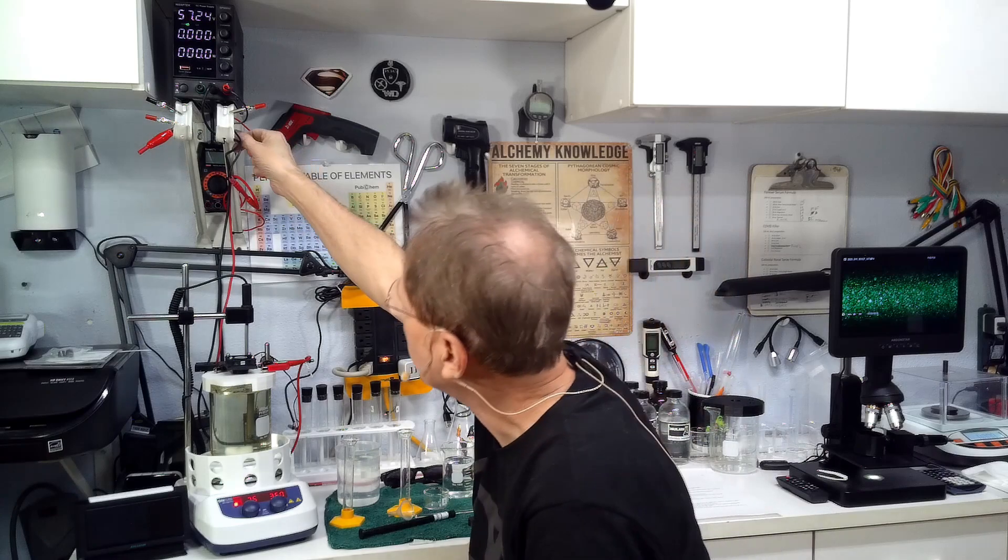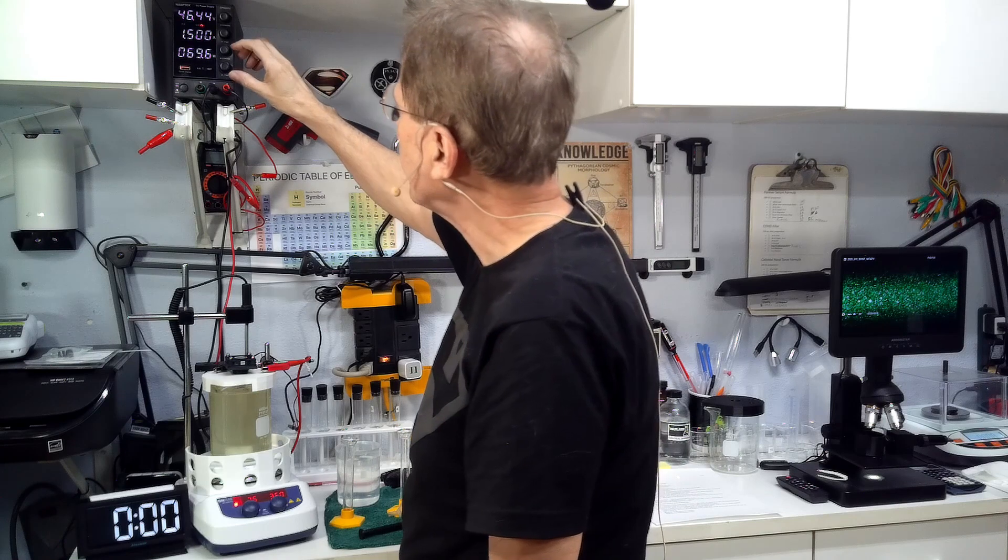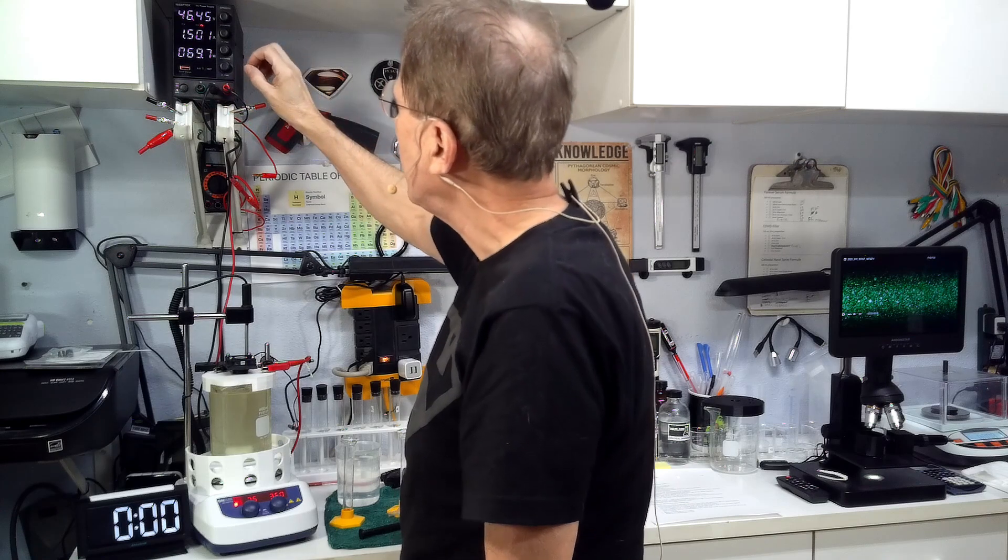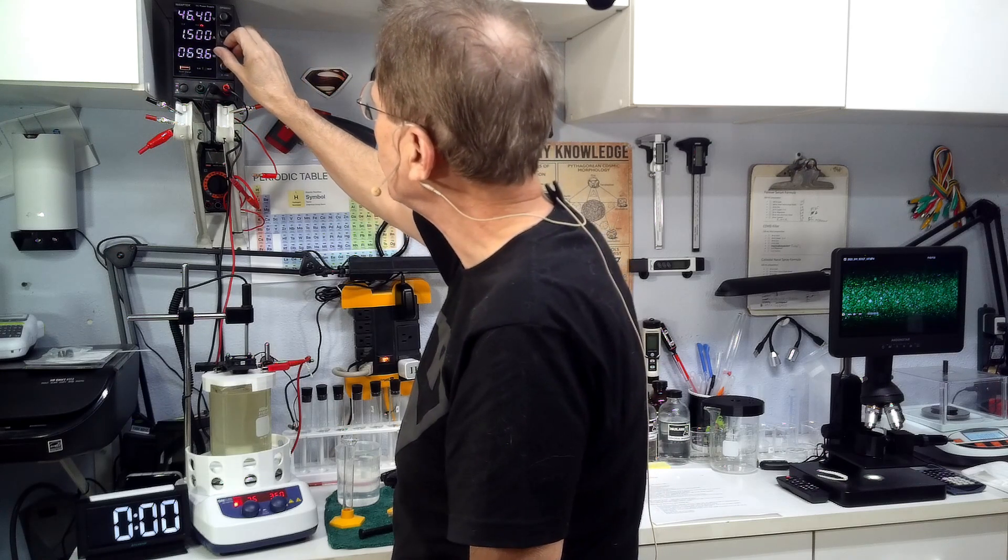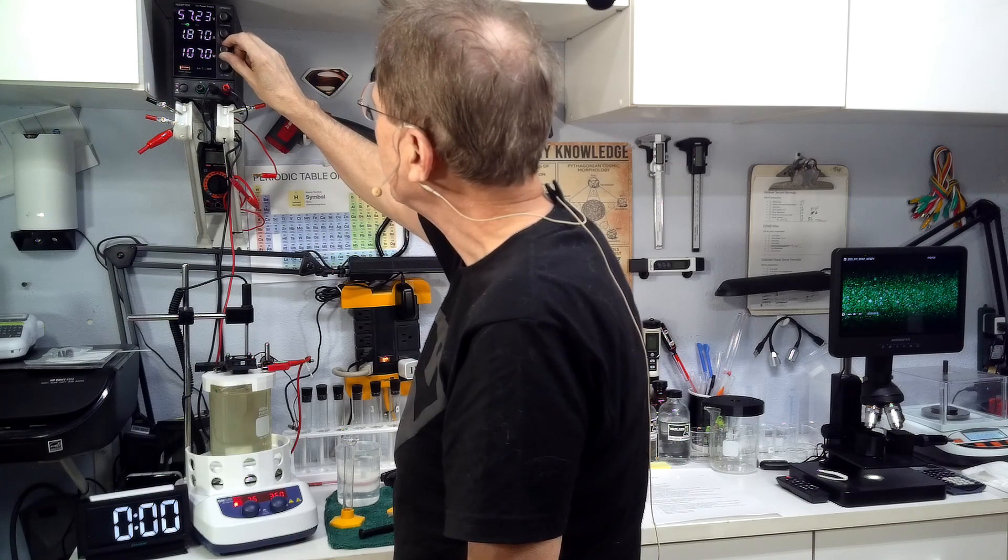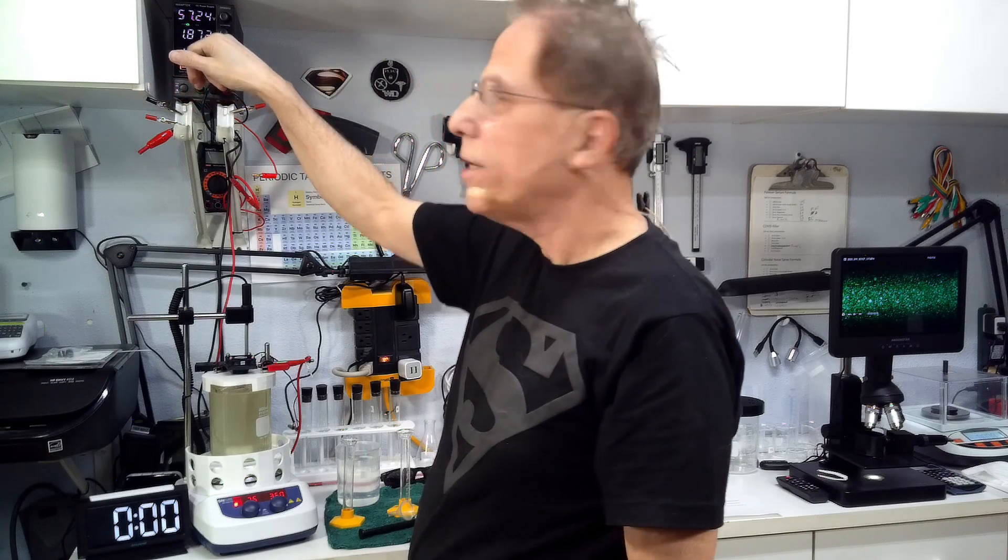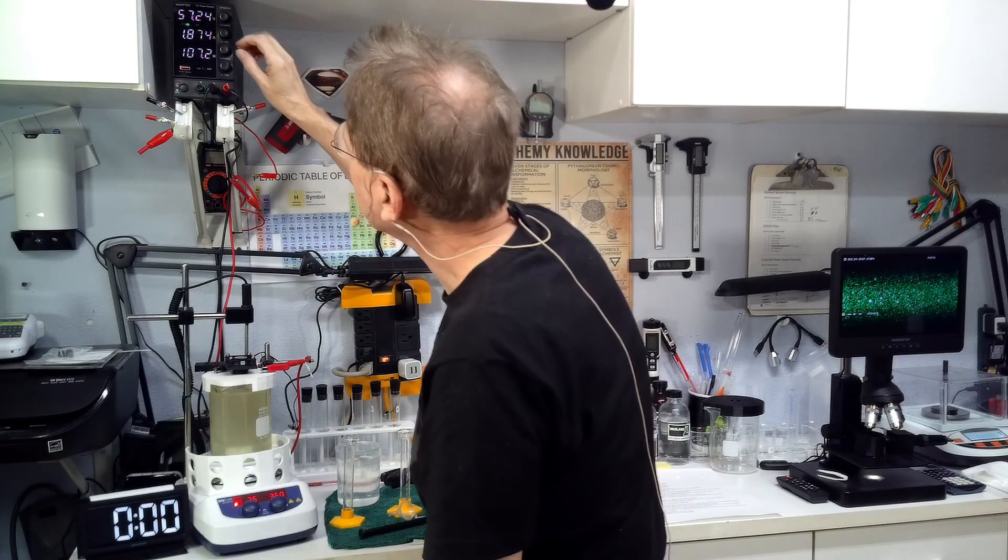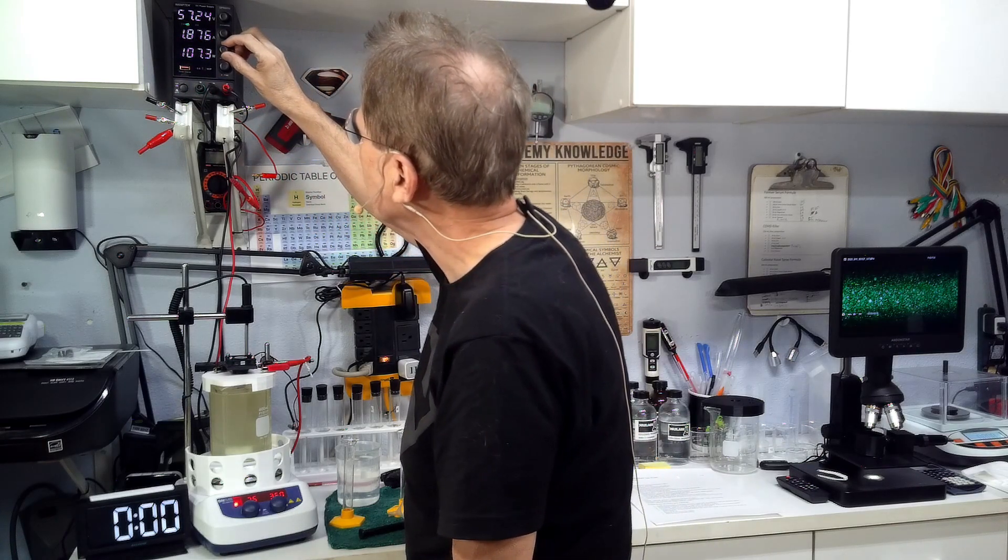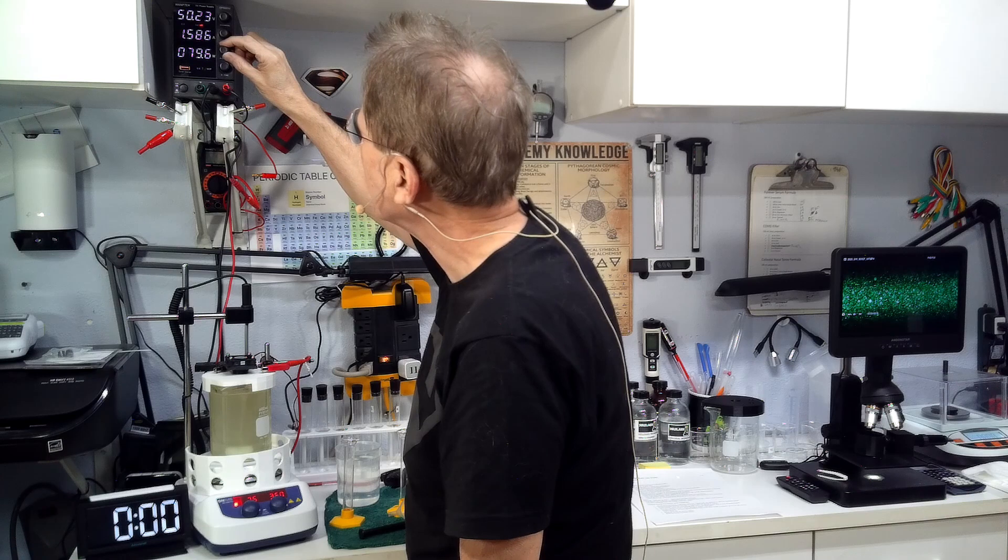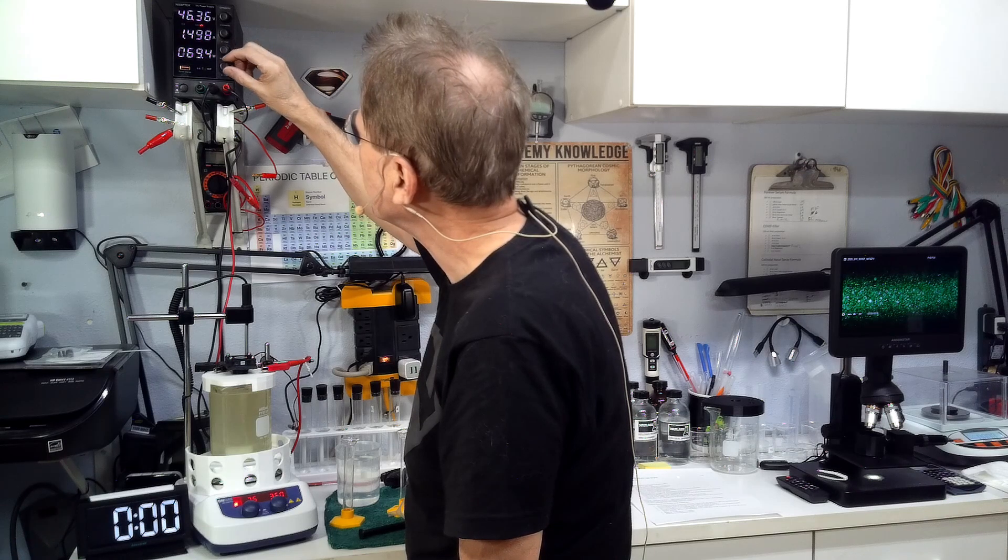We're going to turn this on now. I've already current locked this thing at 1500 milliamps as you see here. If I was to unhook this, the current would shoot up to about 1800 milliamps at 57 volts. Now that's too high because that will create too much platinum dioxide. So I like to current lock this down.